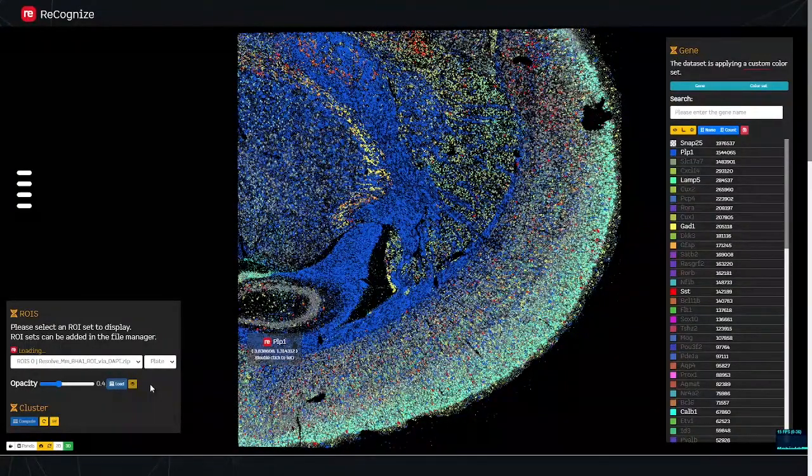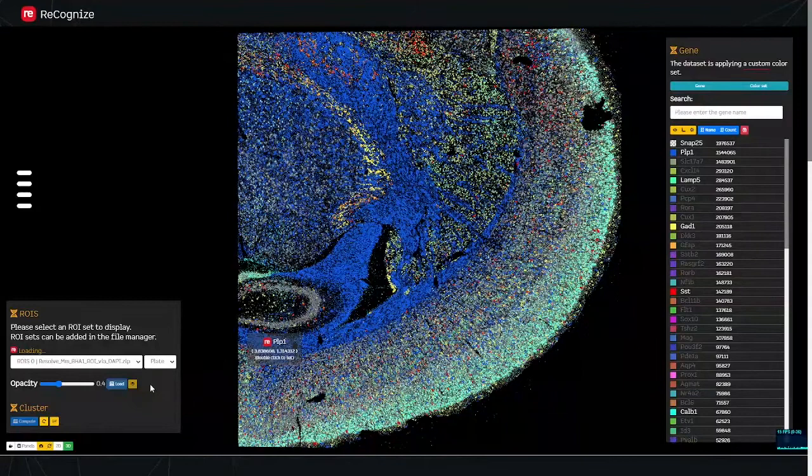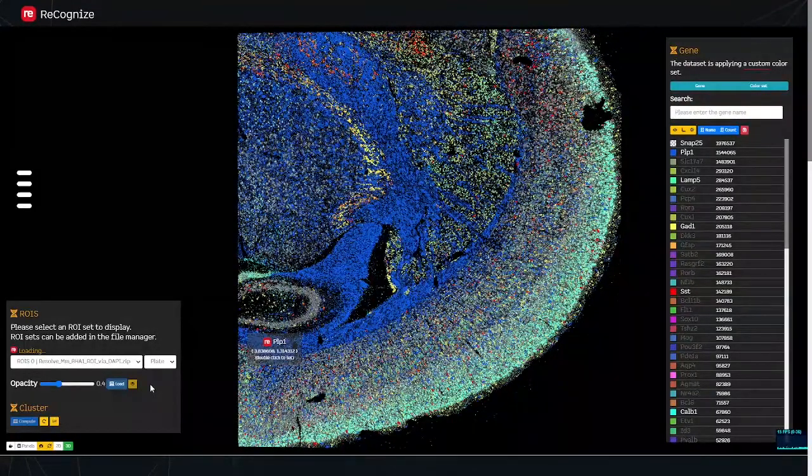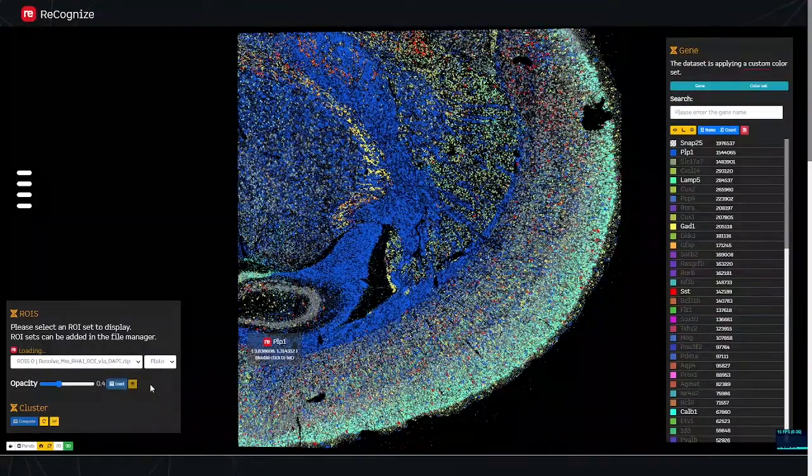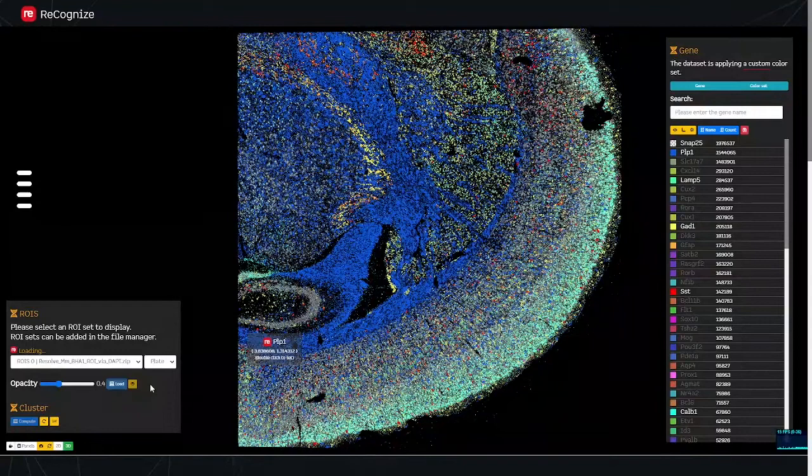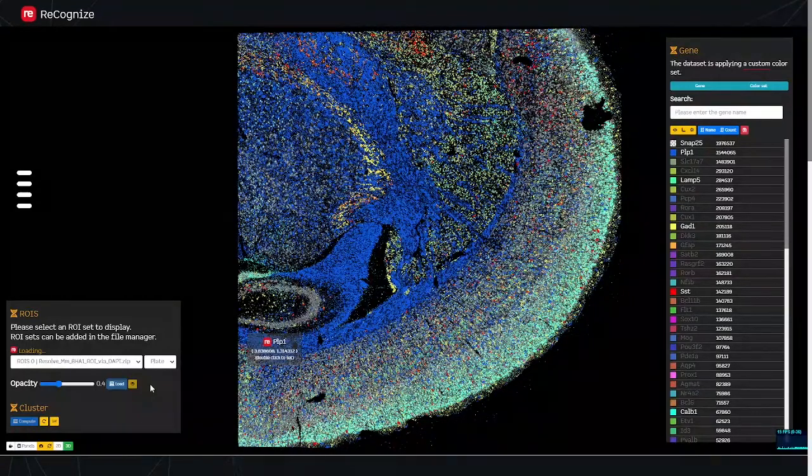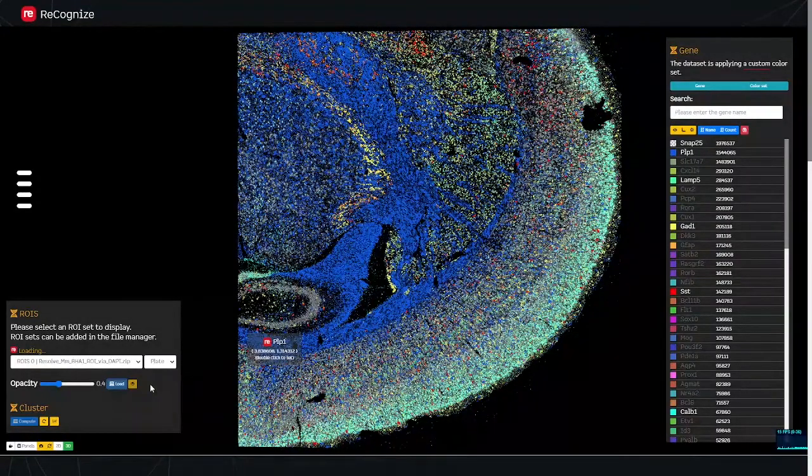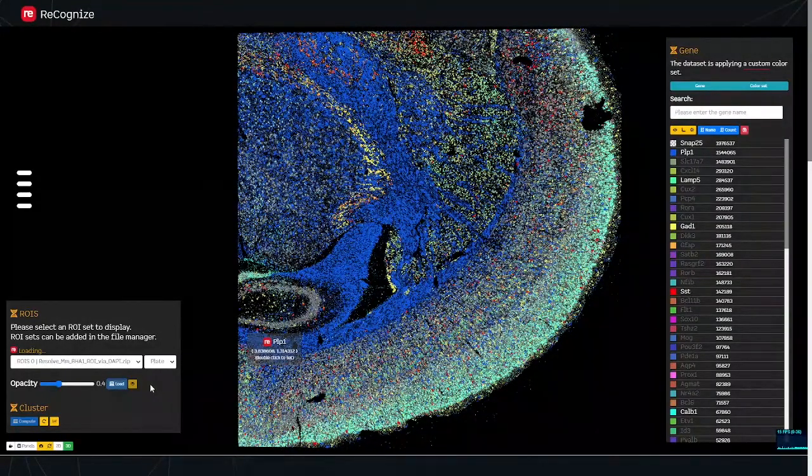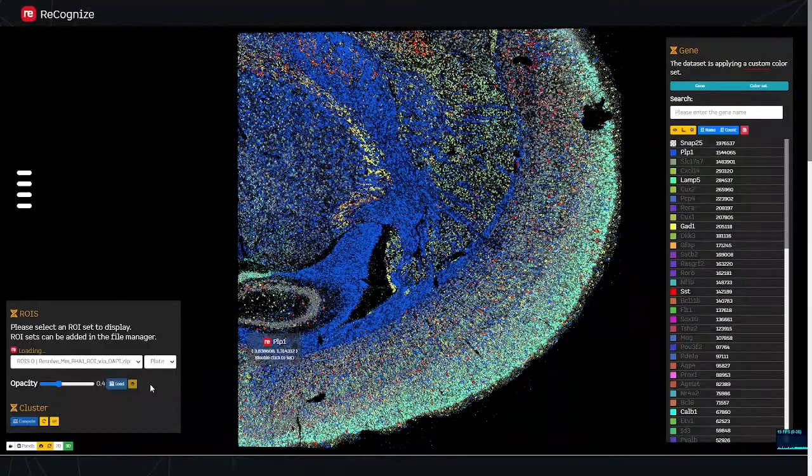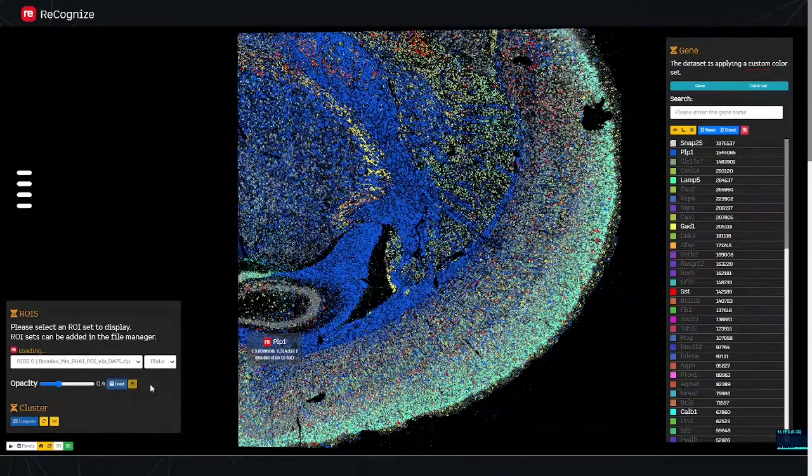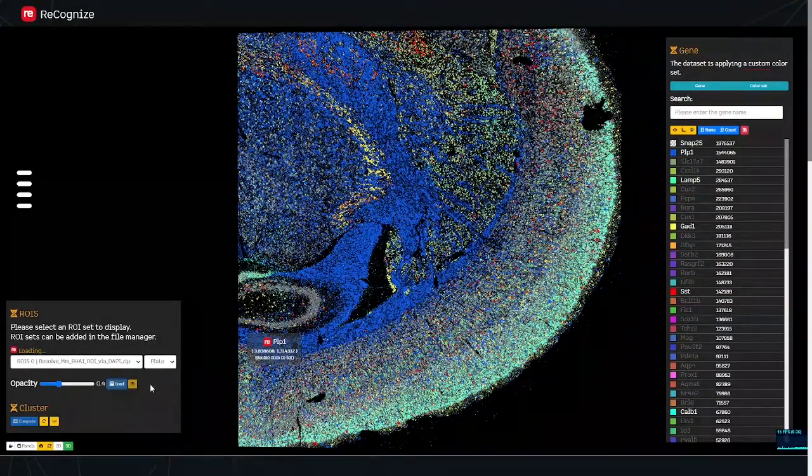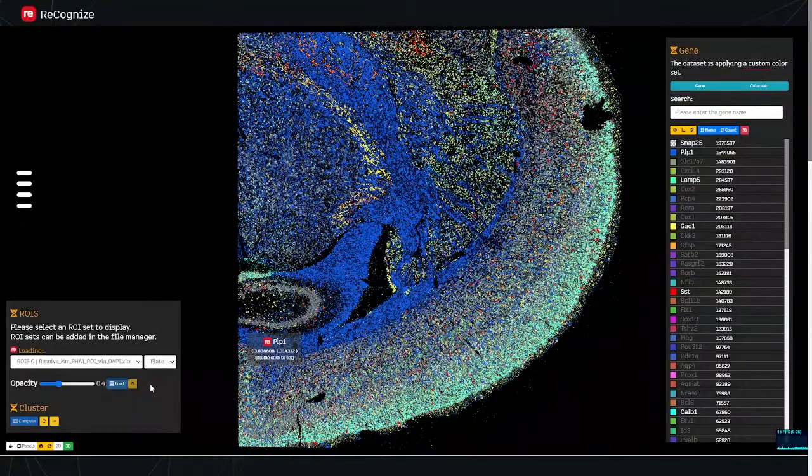In addition to the display of the transcripts, you can also load the regions of interest. As previously shown, this can be freehand drawing. It can come from cell segmentation pipelines using image processing methods, using Brightfield or DAPI images.